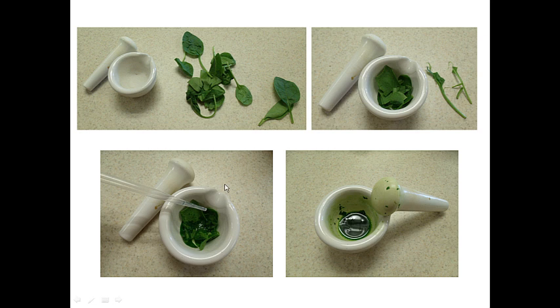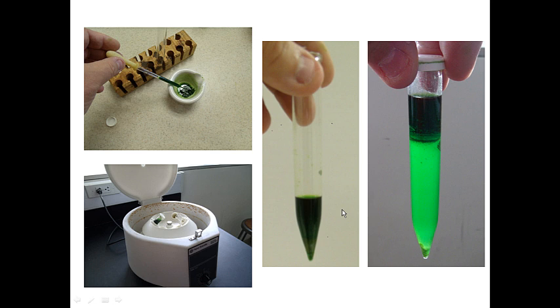So here's what you're going to do. You're going to take fresh spinach, tear off the leaves, leave the stalks behind, add a milliliter or so of acetone, and then crush it with a mortar and pestle, and you'll see you'll get a nice green solution. You're going to transfer that green solution into a 15 milliliter centrifuge tube.